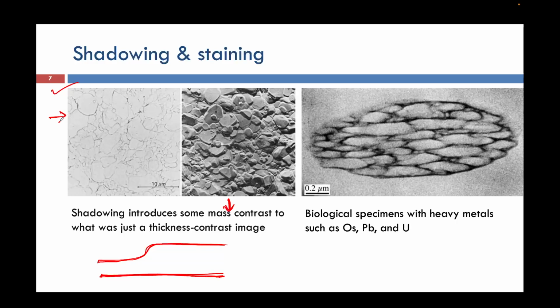So this is an image which we have collected, and here we can see that these are the grains. We can see in this image clearly that there are grain boundaries and some structures, because here there are two types of color you can see. One will be white, and in this image some areas are bright and some areas are dark. That's what I can say.